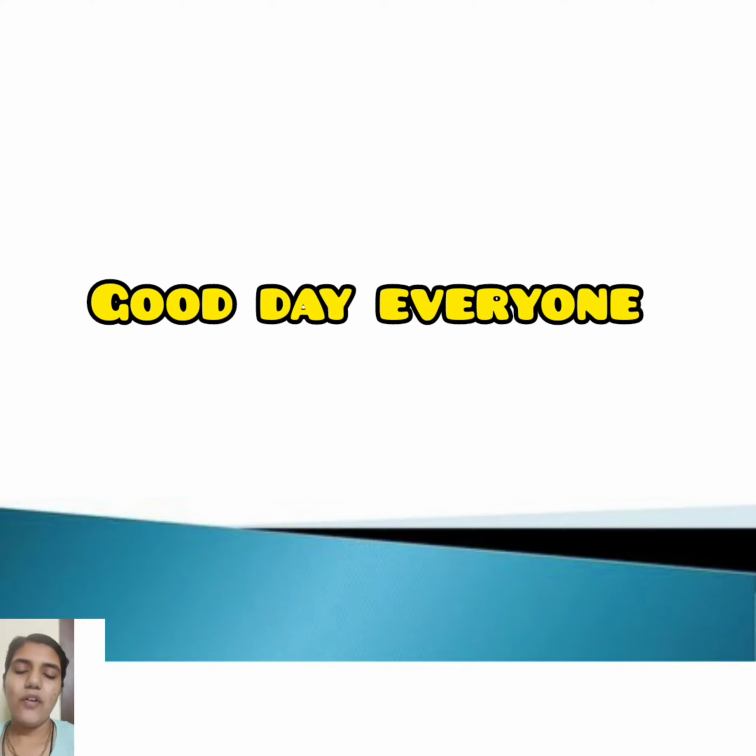Good day everyone. Today our group is going to present an experiment with the help of aseptic technique.